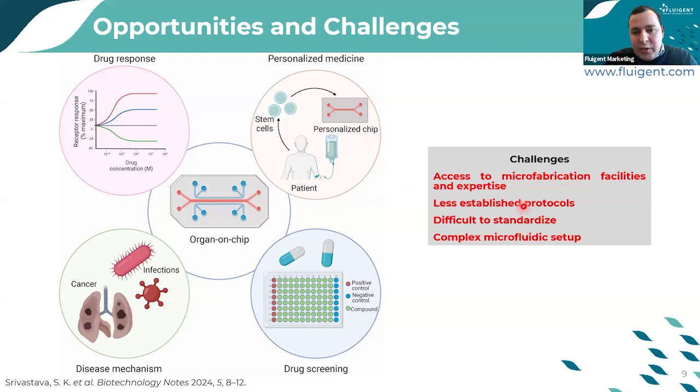Less established protocols: we still don't have a standardized way such as in 2D cell culture. And the third one is the complex microfluidic setup that can be a little bit cumbersome, for example, when you are using it for the first time or integrating it newly into your lab.